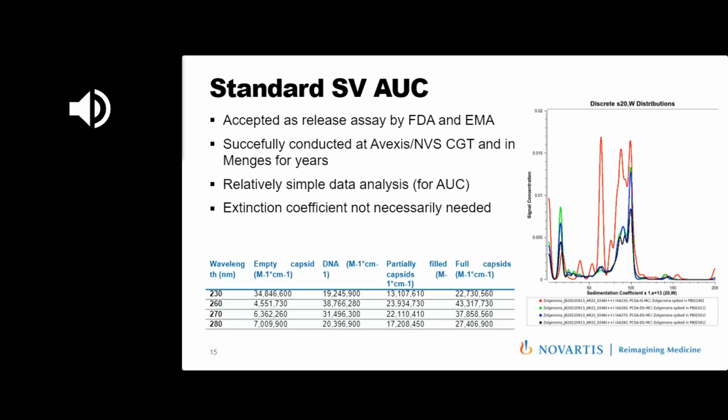We can, of course, use just a single wavelength, but as you can assume, these will give you grossly different answers. What you can try is you can calculate for the protein, and you can also measure that with the empty particles, and we did that, and also for the nucleic acid, extinction coefficients at various wavelengths. You can also use a program implemented in UltraScan where you globally fit, from a concentration series, an internal absorbance spectrum with molar extinction coefficients.